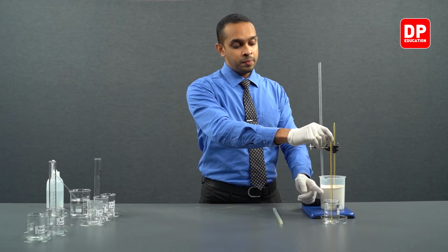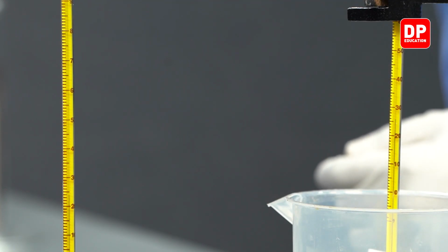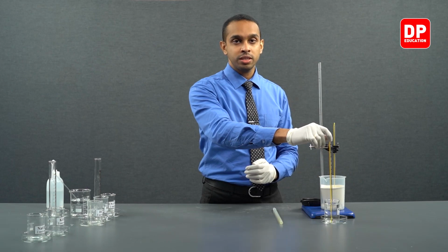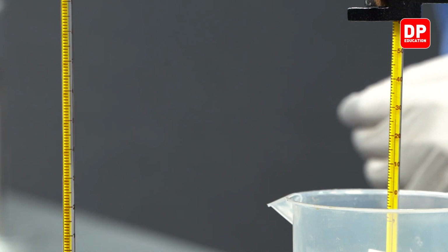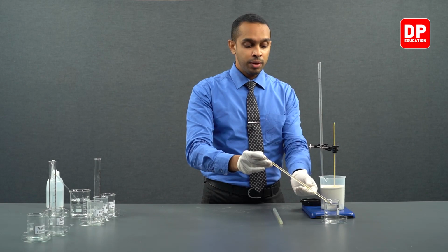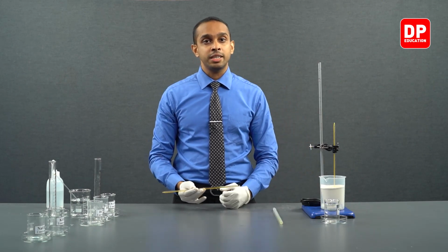And in our ammonium hydroxide solution, the temperature is 24 degrees Celsius. Ammonium hydroxide solution is somewhat cooler than the HCl solution we have here. After noting down these temperature readings, we can move on to measuring 50 milliliters of ammonium hydroxide and adding it to our hydrochloric acid.